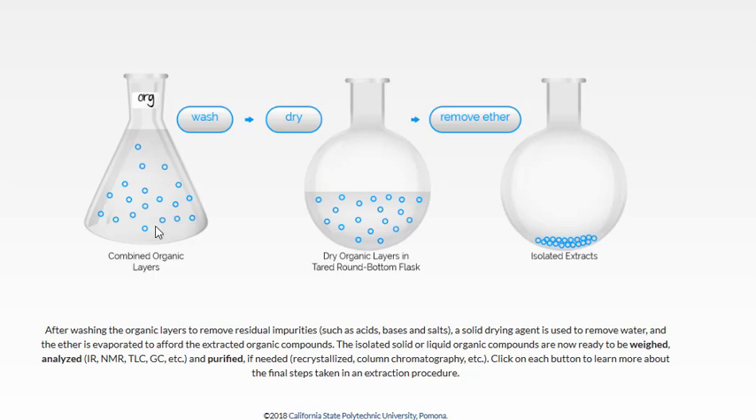Finally, we finish the extraction process with a drying step to remove any water dissolved in the organic layer. Water does have some solubility in ether, so we describe the combined organic layers as being wet. We can first wash with brine — saturated sodium chloride — to remove most of the water, then add a solid drying agent to an Erlenmeyer flask, scoop in a small amount, swirl it around, and that will absorb any remaining dissolved water.